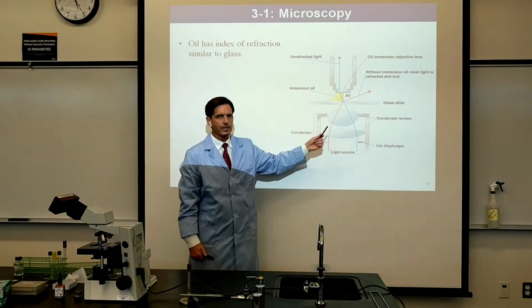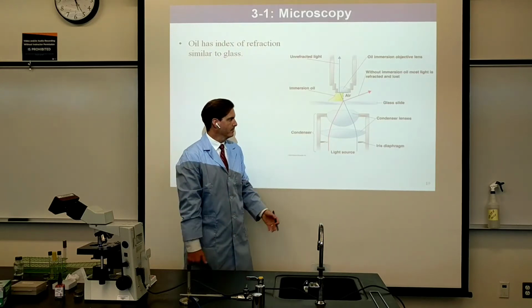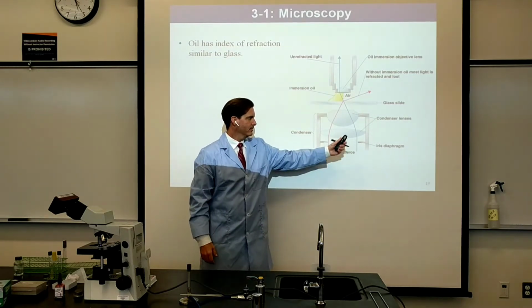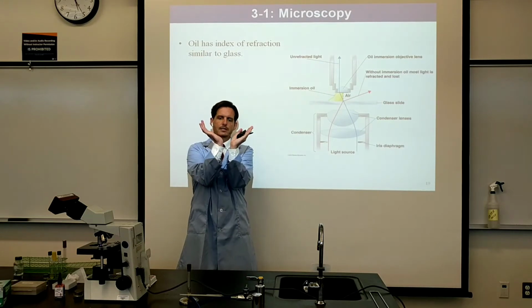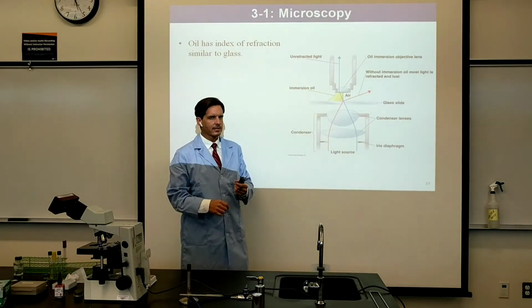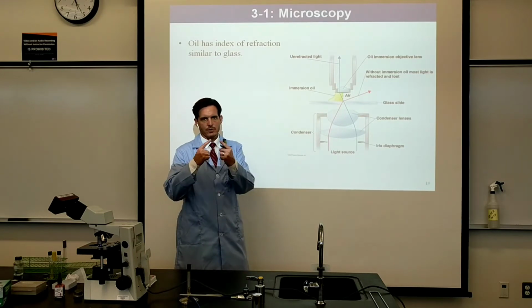Here's a diagram showing the microscope from the light source at the very bottom, and light comes out of the bottom base of the microscope in a straight line, and then it hits the condenser lens, which is beneath the stage, and the condenser lens then directs the light into a cone of light so that there's a fixed beam or a point that's then focused coming up through the specimen.